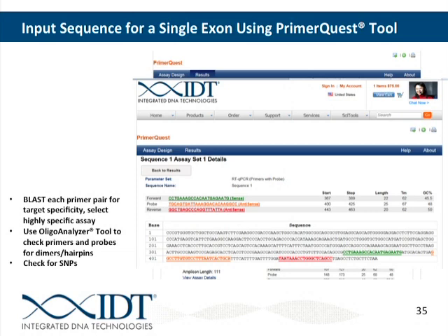And then this will give you all of the exon information individually as a table. So you can see here each of those 5 exons. You can select this and then directly copy and paste it into PrimerQuest. And then again, check those assays for dimers and hairpins, and then you have an assay that would be applicable for CNV analysis in your gene of interest.